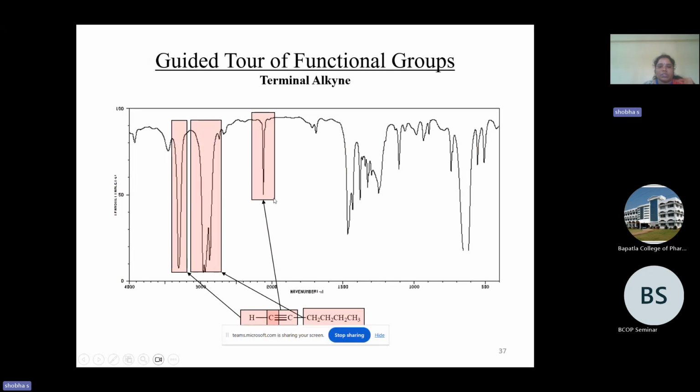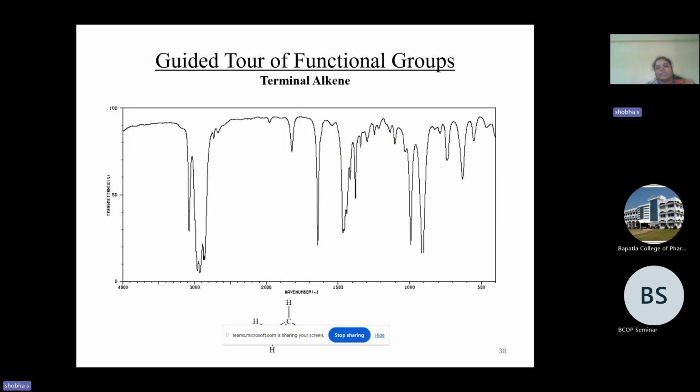How easy it is for us to know the zone analysis. Here, by seeing the scale 500 to 1500, we call it the fingerprint region, where we analyze metallic compounds as well as inorganic compounds. Inorganic means other than carbon. Here the functional groups will be helpful for us from 1500 to 4000 cm inverse. There may be some overtones of the C-C single bond stretchings here.